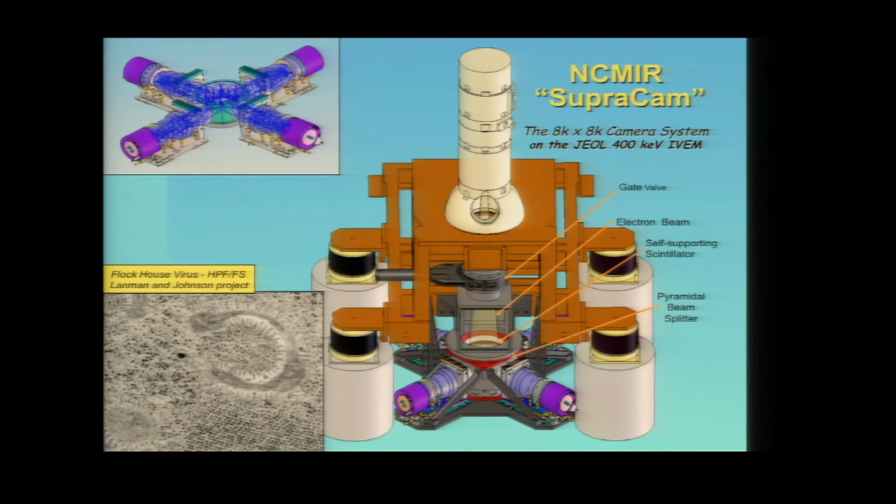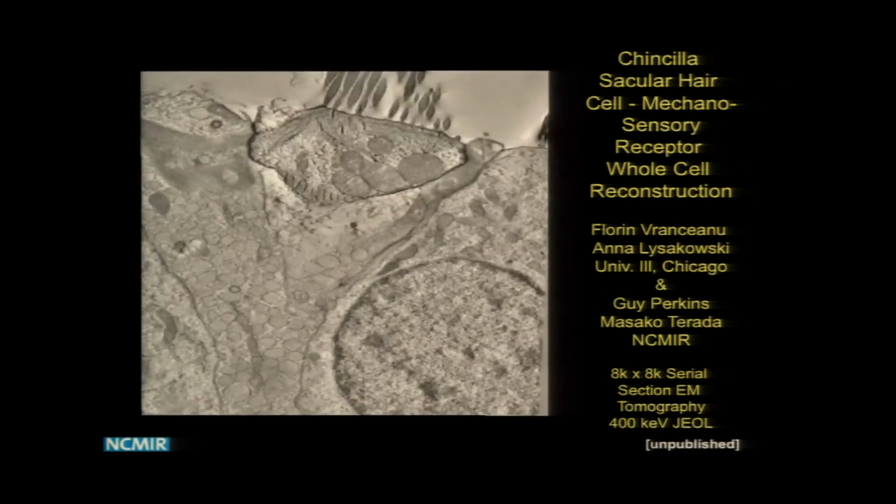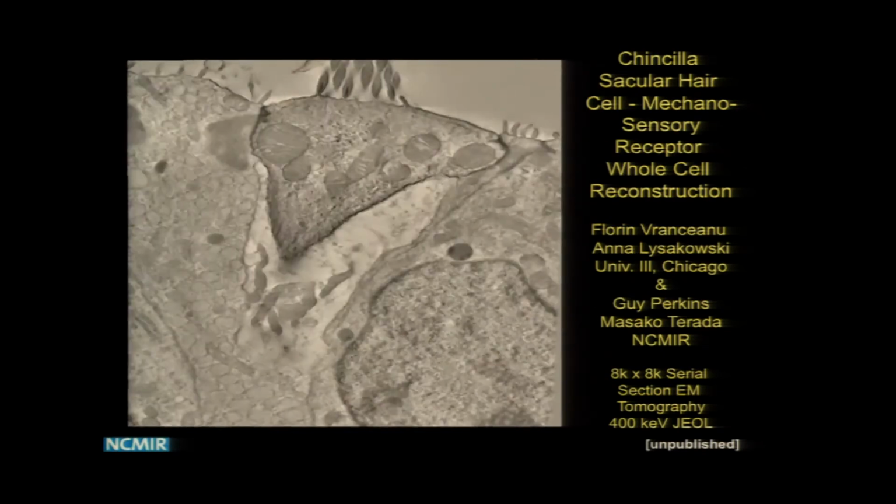It's a 25-year-old microscope, and we put a $5 million worth of parts camera under it, much more extensive than anything on the Hubble. So this is 8K by 8K with 30% contrast at Nyquist for any engineers. So we acquire with this instrument, in an automated way, tomograms, one right after another, of sections that are 1/4 to 1 micron thick. And this is one example of a complete cell reconstructed with this 8K device.